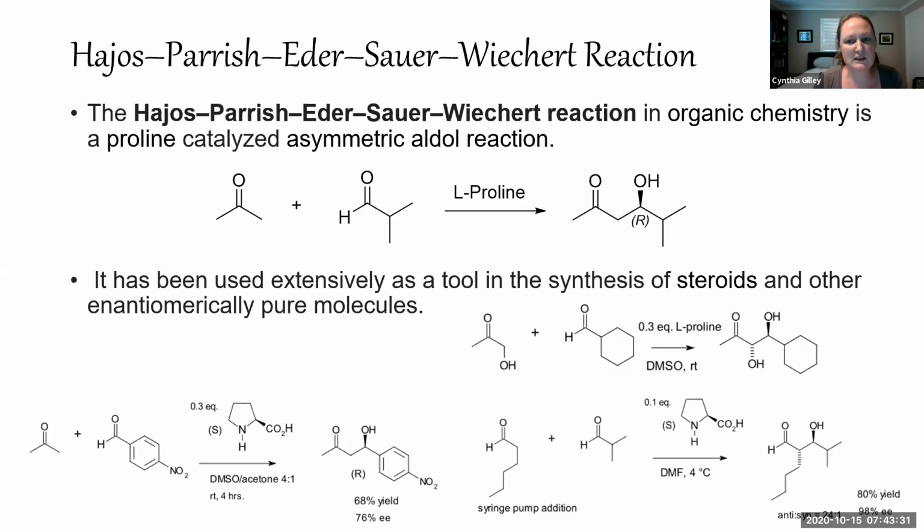And then even more specifically than calling it an aldol reaction, we can call it a Hajos-Parrish-Eder-Sauer-Wiechert reaction, which I know is a mouthful, but there's credit being given to a lot of chemists here who developed this reaction from multiple different groups simultaneously. And essentially what that reaction is defined as in organic chemistry is a proline catalyzed asymmetric aldol reaction.